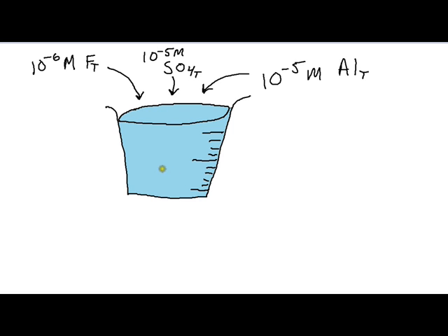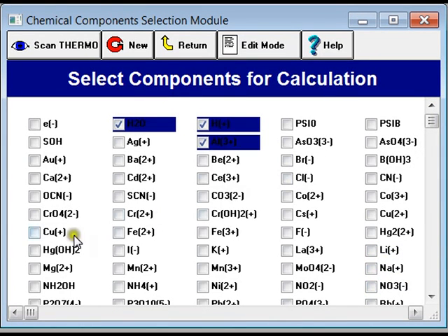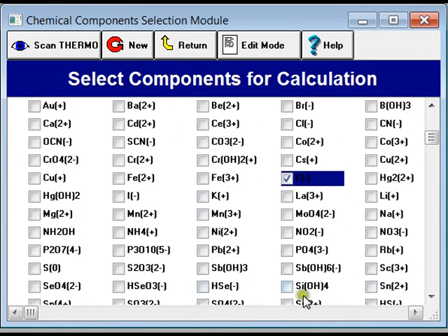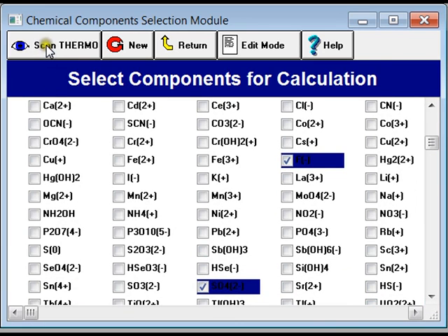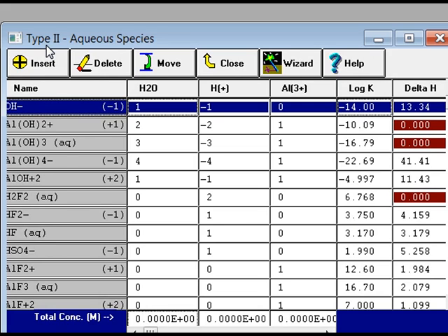You could go to MINEQL+ and select aluminum, fluoride, and sulfate, and then press the Scan THERMO button, where the program will look for all the interactions between aluminum, fluoride, and sulfate in the database of over 1,700 chemical species.